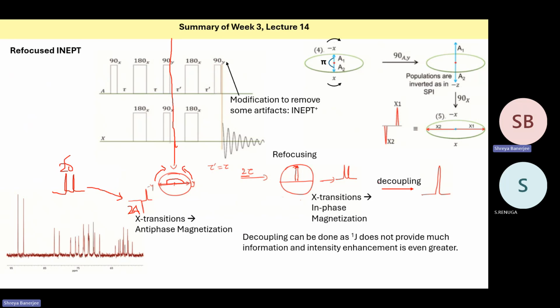So now you can do decoupling. Earlier we saw that when we have signals in opposite phase, decoupling is not possible because they will just cancel out and become neutral. But now by the refocusing, we are able to decouple the signal, because when it is refocused, both are now in the same direction. Both signals will appear together at the same frequency. So decoupling has happened.